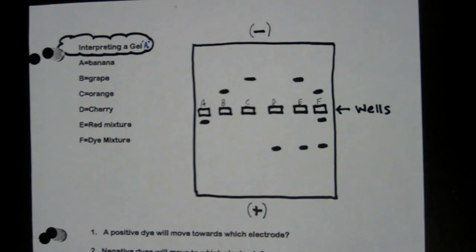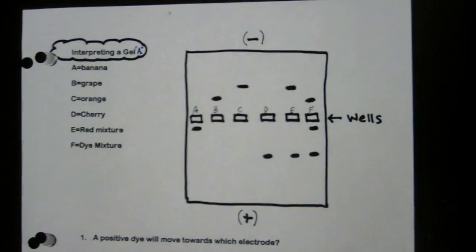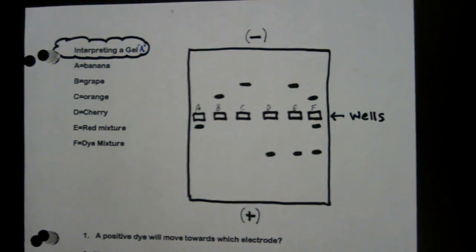So how do you interpret a gel once you have the results? This is a practice gel. We're using dyes for this one, assuming that, and we have six wells.